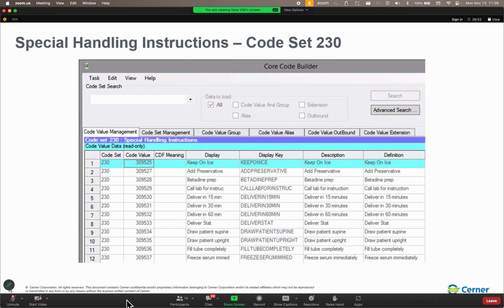Now the next column on here, what kind of barcode are we going to create? Code 128, code 39, with check digit, without check digit. What is that barcode going to look like? We continue to scroll over. How's it going to be adjusted? So 0 and left, it's going to be adjusted to the upper left-hand corner.